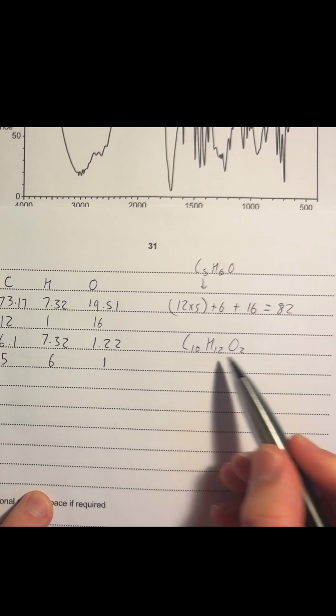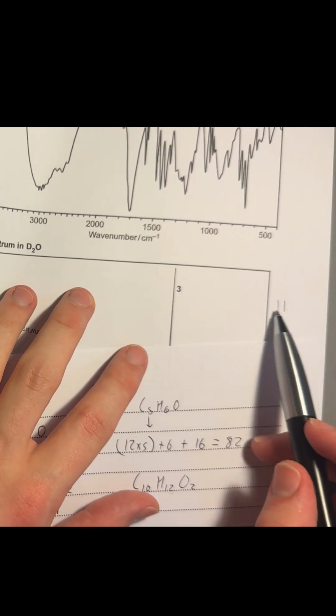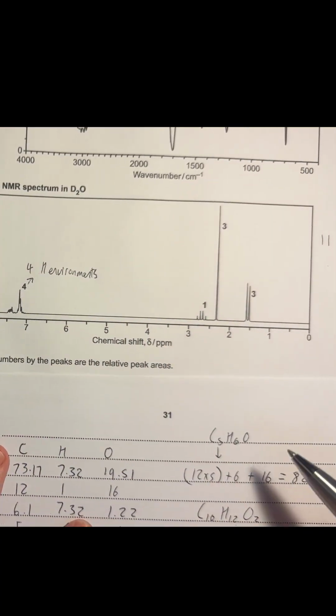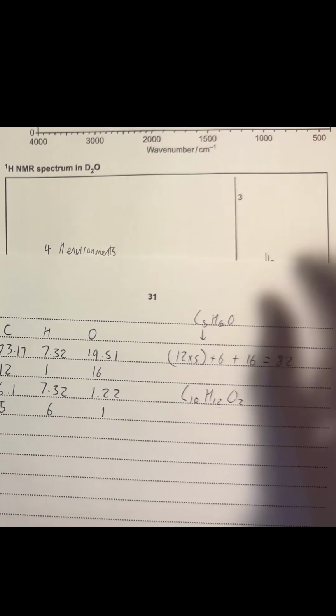This then briefly leads me back. As you can see, 12 H's, but over here we found that 11 H's were made. Sorry, not made in the NMR, but only in D2O. So we know, as there's no N's, there is going to be at least one OH proton there.